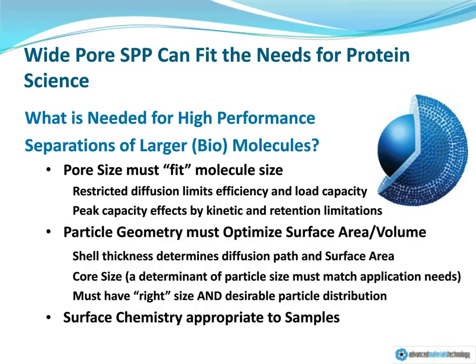Now, as I mentioned, much of the last decade has been spent on really looking at the question of, well, we had an unanticipated improvement for small molecule applications with such superficially porous particles. Can those advantages be translated to the analysis of larger biomolecules? Or, as I say in this slide, can superficially porous particles fit the needs for protein science? Now, I'm originally a protein biochemist, so the opportunity to improve resolution or to improve performance would be a welcome one for anybody who studies complex protein preparations.